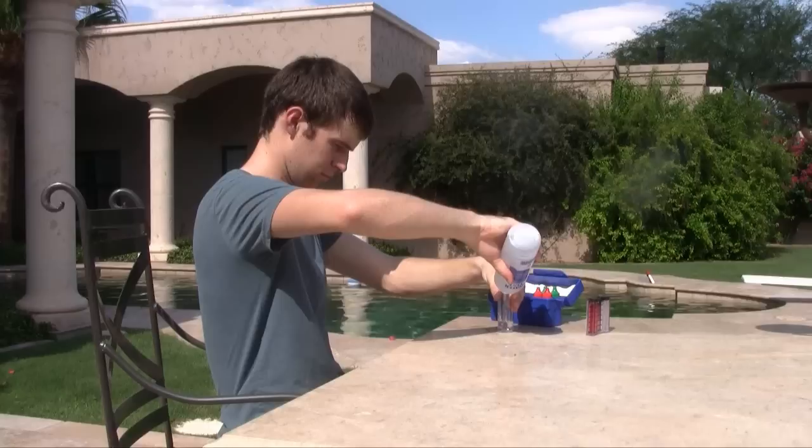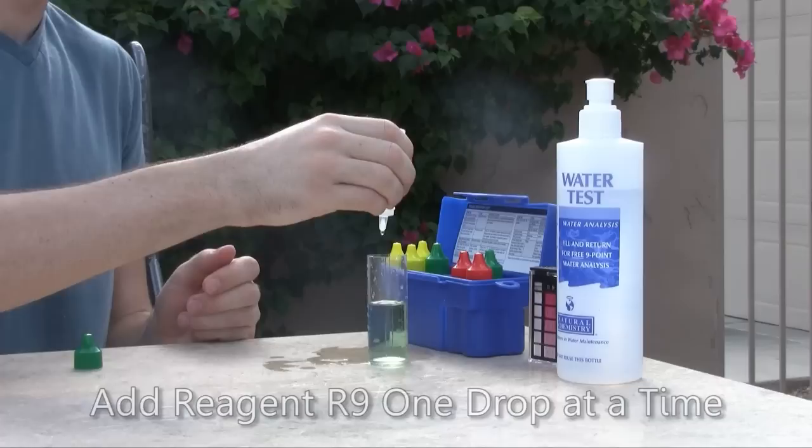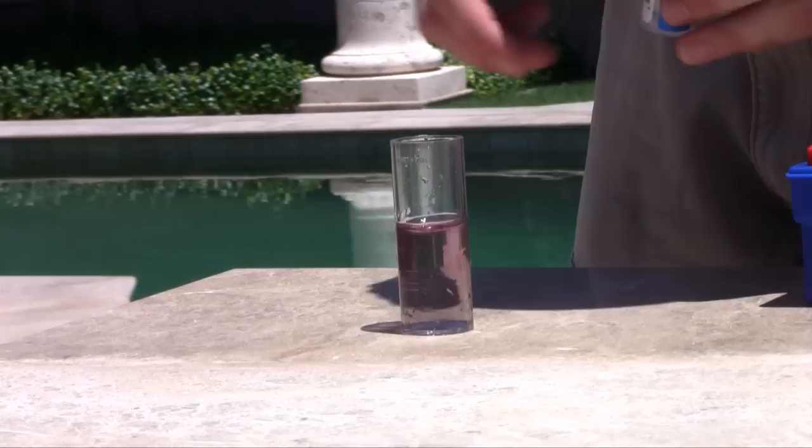Finally, you should test your pool's total alkalinity. Rinse the large test vial with pool water and then fill the vial to the middle line — 25 milliliters. Add 2 drops of reagent R7 and then 5 drops of reagent R8. Swirl the sample to mix. The test solution should turn green. Now slowly add reagent R9 one drop at a time, swirling the mixture and keeping count as you go. Stop adding drops when the test solution changes from green to red. The ideal range for most pools on total alkalinity is between 80 and 120 parts per million.